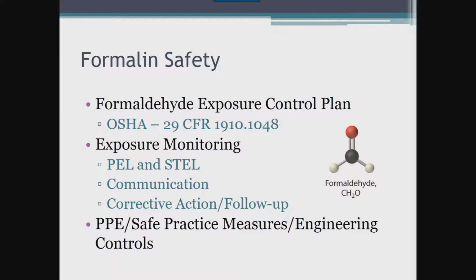Results of monitoring must be shared in writing with each employee within 15 days of knowledge of the results. If acceptable levels of exposure exceed the 0.75 ppm, a written plan to reduce the employee's exposure must be given to each employee exposed to formaldehyde. Each written plan must describe the corrective action being taken to decrease exposure, and medical examination might also be required by your employee or occupational health departments to assess acute and chronic effects from that exposure.